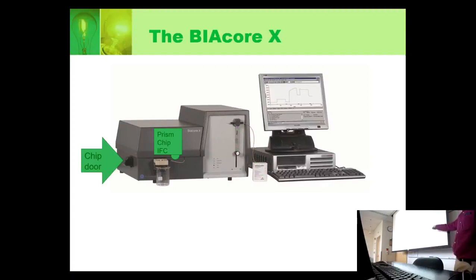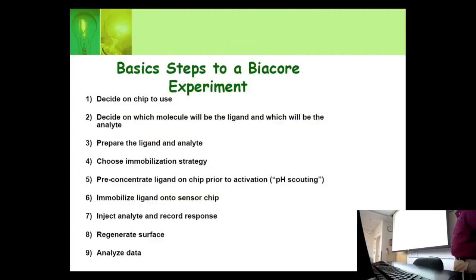So the main thing is you always have to keep an eye on your inlet, that your inlet has buffer in it. It flows through here. You inject with this sort of beige spot right here, and it flows out there. And yeah, that's what you have to keep an eye on. By the way, it moves so slowly, at like 50 microliters per minute. So that means you're not going to be worrying about it running out while you're not looking.